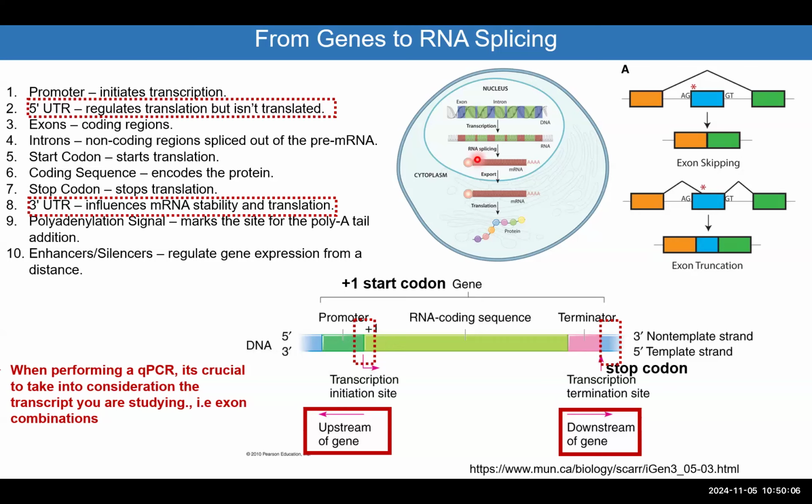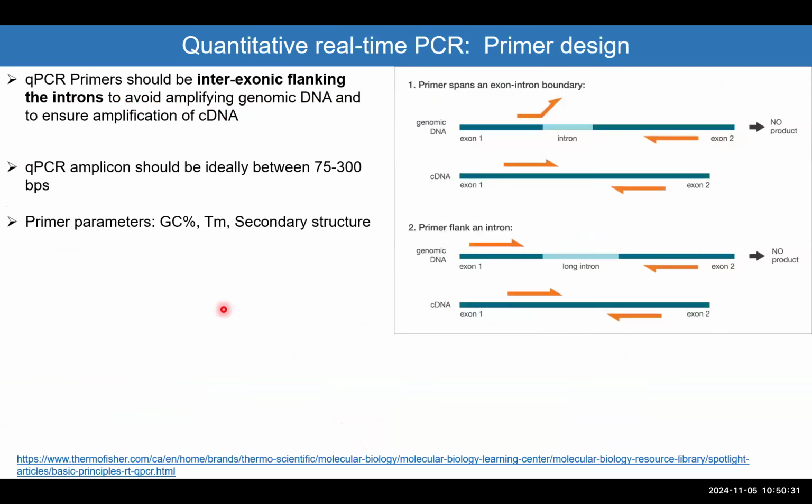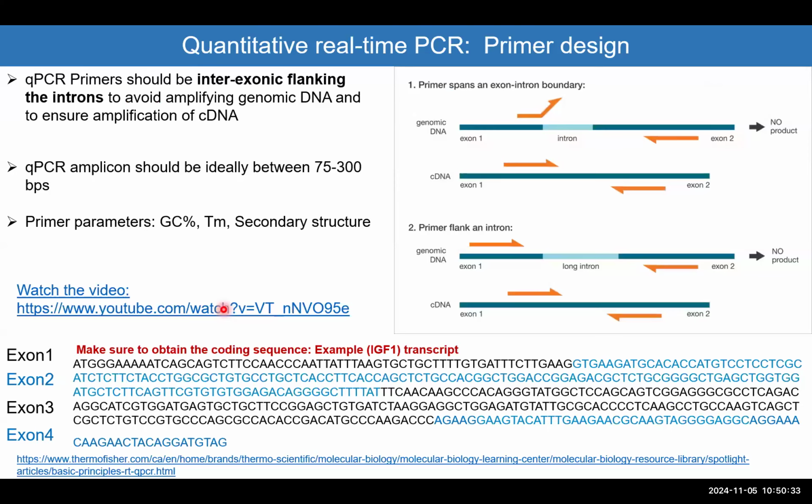Now, why is the amplification of more than 300 base pairs not going to take place? Because simply we don't give the time. You know that the Taq polymerase needs some time to generate a product. For example, for 1,000 base pairs, it needs 1 minute. So we don't give enough time to do more than 300 base pairs, to assure the specificity. Did I answer your question?